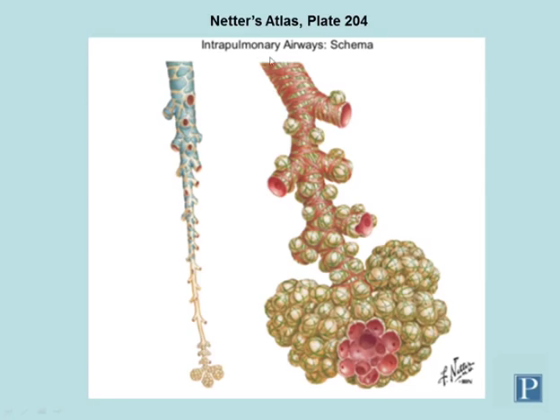On the right you see the end of a terminal bronchiole, which is the end of the conducting portion of the respiratory system — no gas exchange occurs here. Further down, sac-like alveoli appear attached to the surface of bronchioles; at this point these bronchioles are referred to as respiratory bronchioles. Notice that the number and density of alveoli greatly increases the further you go down the respiratory tree, until the wall of the passageway is composed almost completely of alveoli.